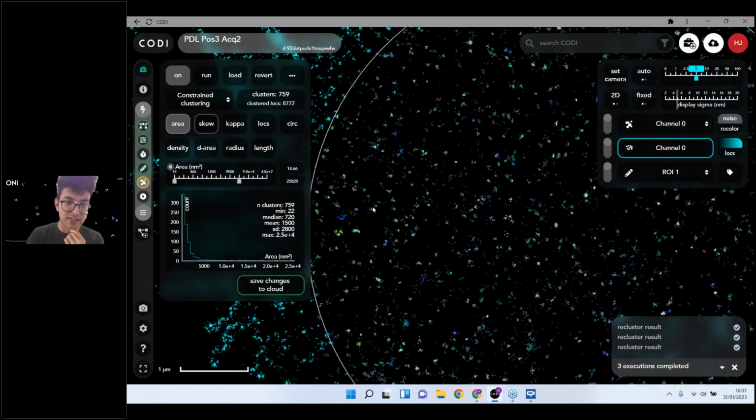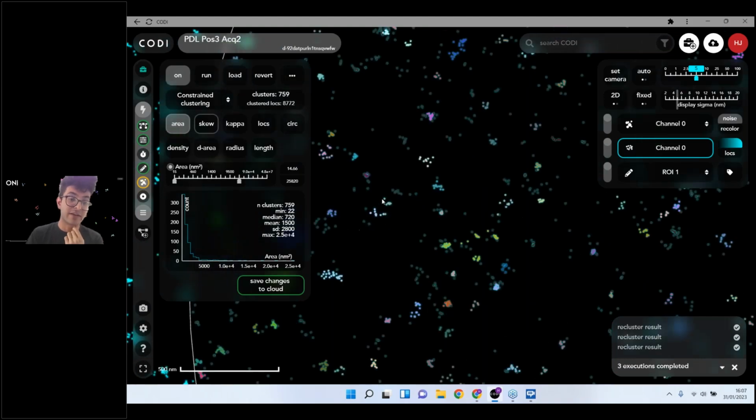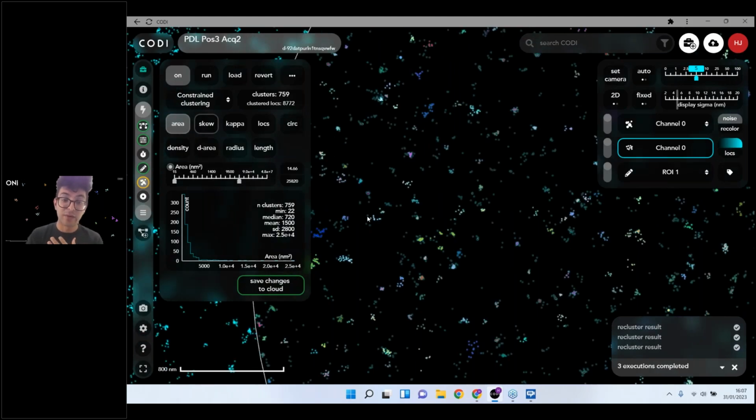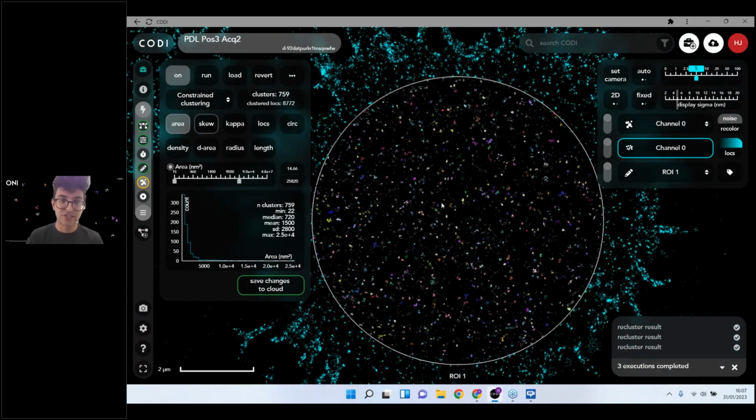And again, if we look into that same cluster as before, you can see there are now actually 2 clusters here, which is definitely an improvement on that one big one, and also tells us that we were actually able to use some of that data that previously we would just be throwing out with filtering. So this is the kind of operation you're able to do using the constrained clustering. And here you can see we've got more clusters than we did with DBSCAN. That's because DBSCAN is not able to pick out these different clusters at different levels of the tree in the same way that HDBSCAN combined with constraints can do.